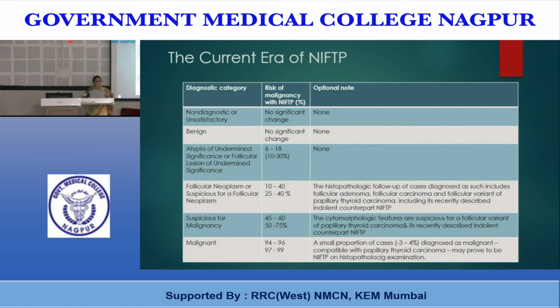But in this classification system, the Bethesda system recommends that you add a note in front of the category if you are suspecting nuclear features of NIFTP. We will see what those nuclear features are. So here you have an optional note column at the end where you can clearly write that there are so-and-so features favoring FVPTC, but cytology cannot differentiate between FVPTC and NIFTP, and this possibility should be considered. So you have this facility and you can write this elaborately in your report.